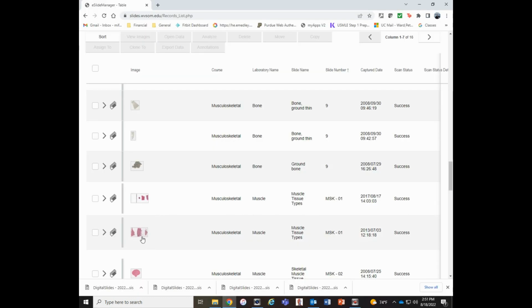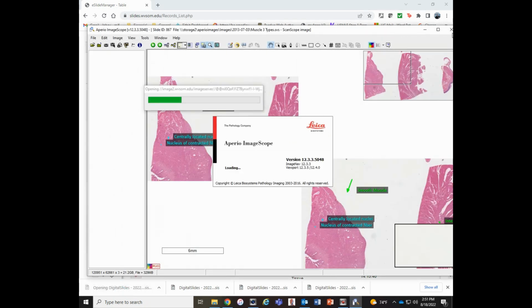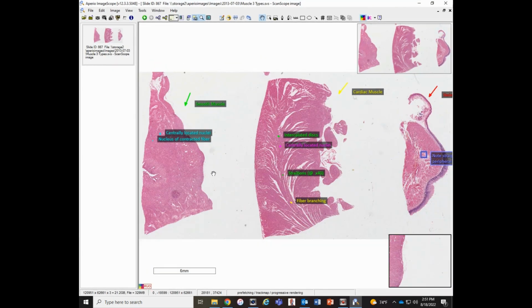All right, after all this to do, we are finally going to take a look at the histology of muscle itself. So we have three different types of muscle, and we've discussed this in a few different places, but here we've got an example on the left of smooth muscle. In the middle we have cardiac muscle, and here on the right we have skeletal muscle. Now, right now I'm teaching the musculoskeletal course, so skeletal muscle is mostly what we're concerned about, but there are features of smooth and cardiac muscle that are going to be interesting as well.